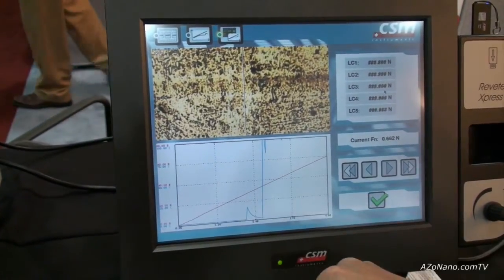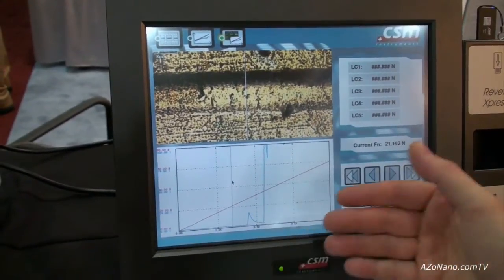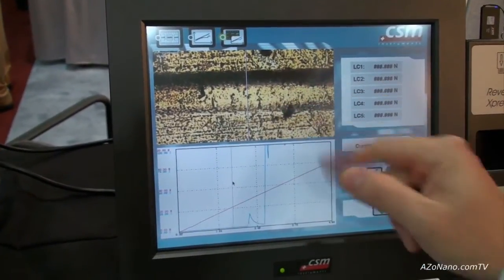Now if I click anywhere along here it will go to that position along the scratch. So we're correlating the length of the scratch with where we are.